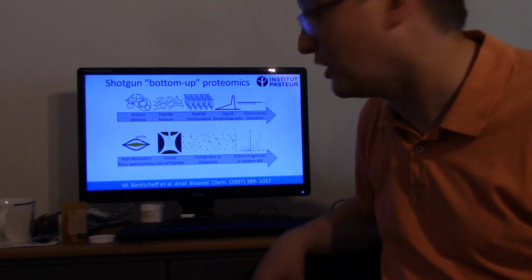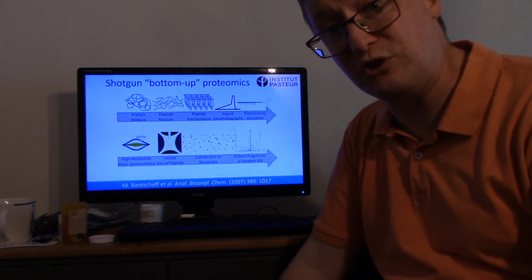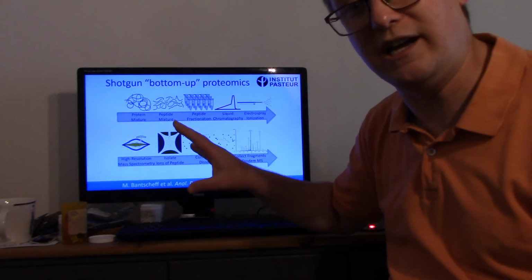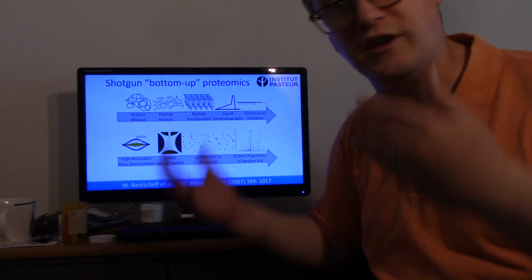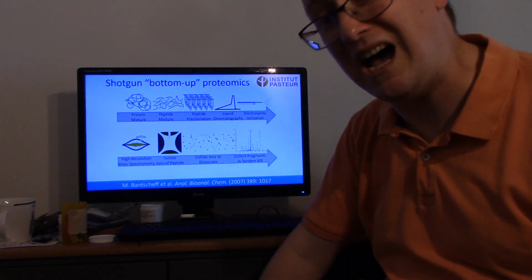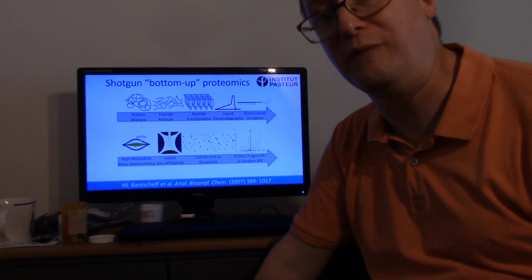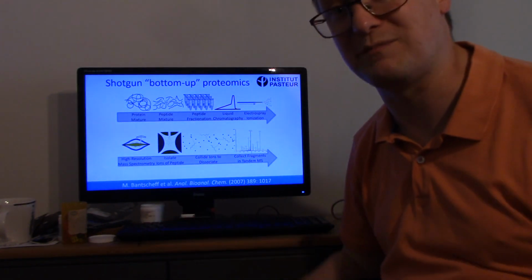Now, the mass spectrometer cannot measure things that are not charged. It needs ions to start with. So these peptides are turned into ions by passing them through electrospray ionization, sometimes at 3,000 volts or more. This produces a cloud of charged peptide ions that can then be measured 2 different ways by the mass spectrometer. All the things in the bottom row here take place in the mass spec. We see that we have a high resolution measurement, very typically, of the peptide ions in intact form. This is something that we call the mass spectrum, typically a highly resolved, highly mass accurate mass spectrum.